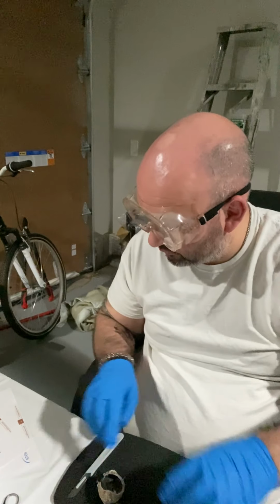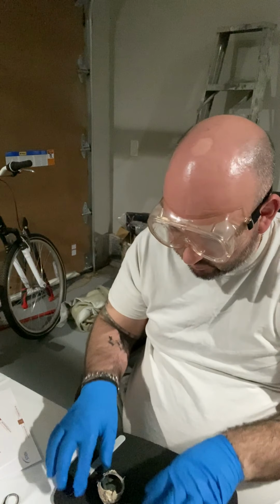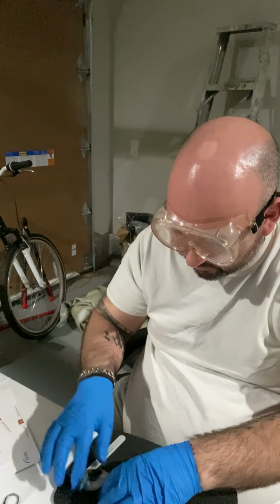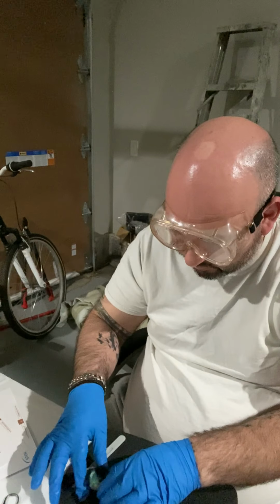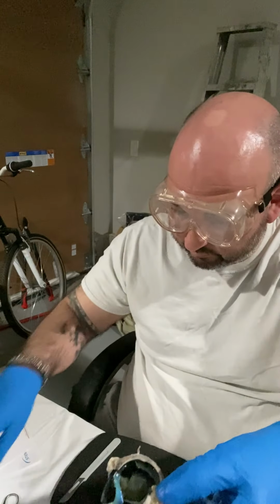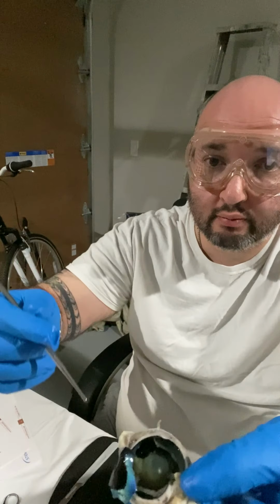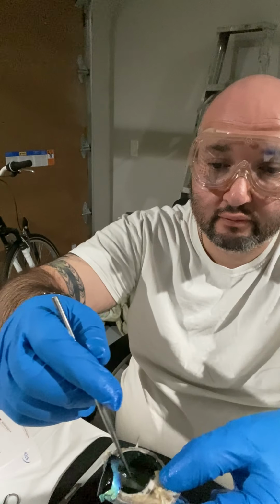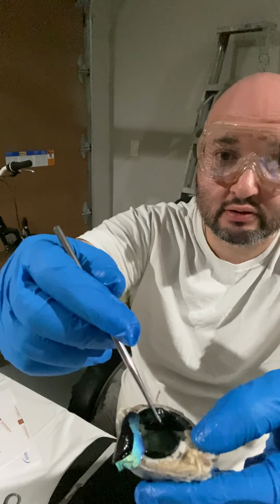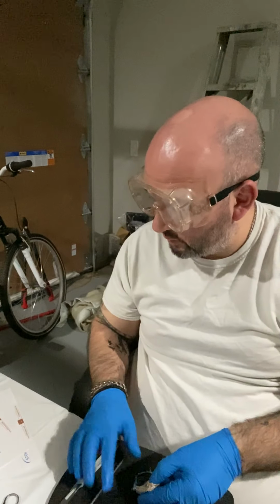Okay, well, I actually think I may have cut a bit too much because, you can see here, I have a very jelly-like liquid, and this is my vitreous humor.